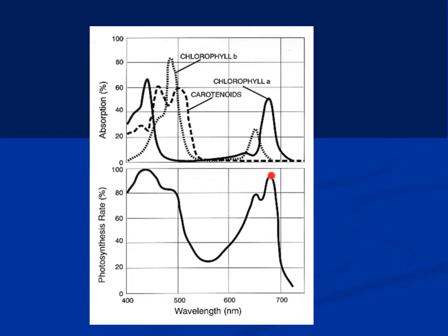Although this is not for us to understand right now, the main thing is that various molecules have various peaks which can be used to determine their concentration.